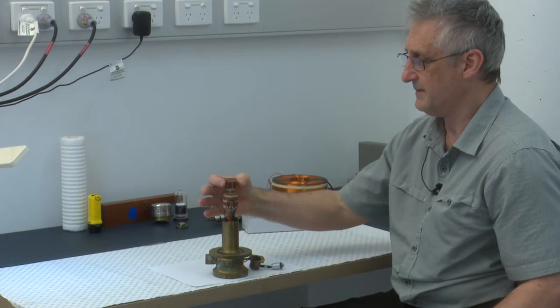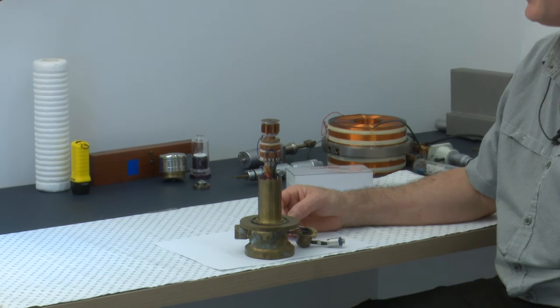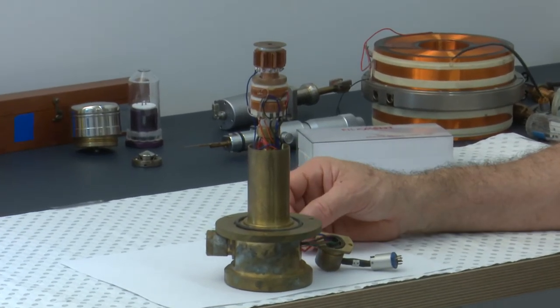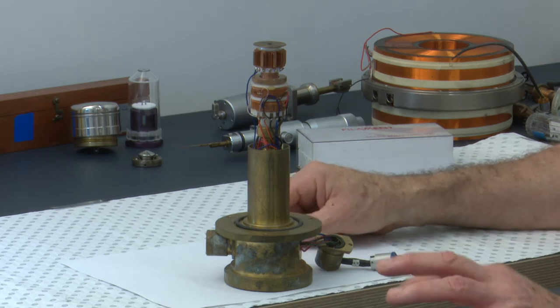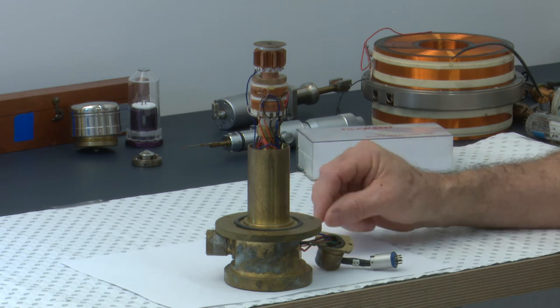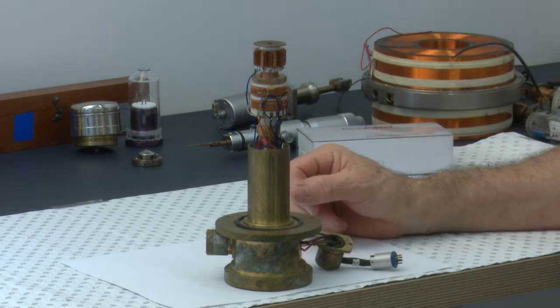Around this beam are positioned, in this case, eight little electromagnets. And we control all eight of those electromagnets using two controls, again, an X and a Y. And we adjust the X and we adjust the Y following certain procedures, and that allows us to control and shape the beam and make sure it is in fact round.